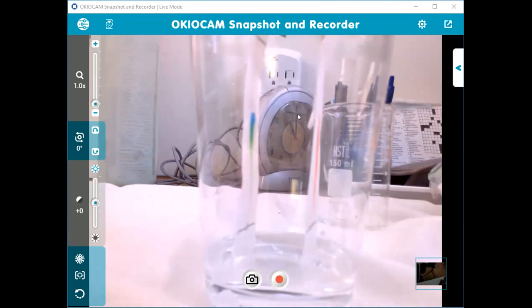This actual water line is above here. And this one was a little bit short, meaning this distance here was not 1.5 and 8.5. For whatever reason, the second distance was way less than 8.5. But the actual water lines are marked in red.